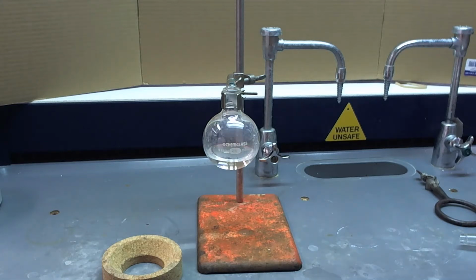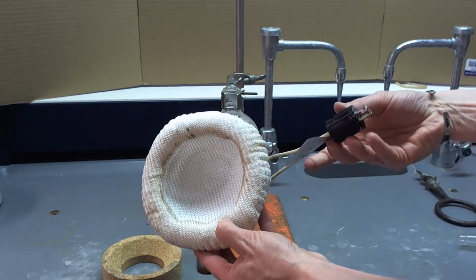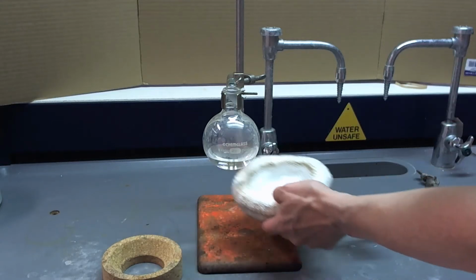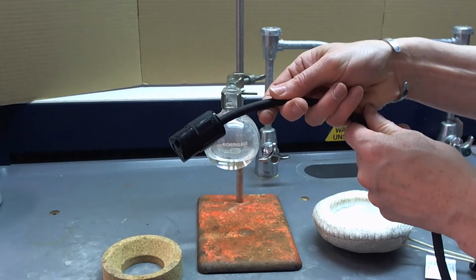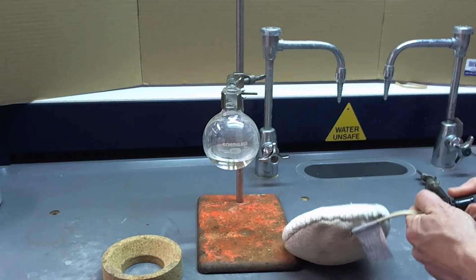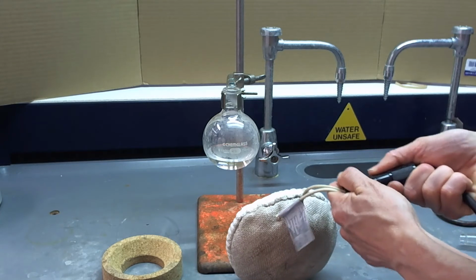We will need a heat source, and we're going to use what's called a heating mantle. It has sort of a round plug. Okay. It's going to go like this. Right, now if you're wondering how that's going to plug in, that's a good question. You need a cord with a round plug that will fit to the heating mantle.